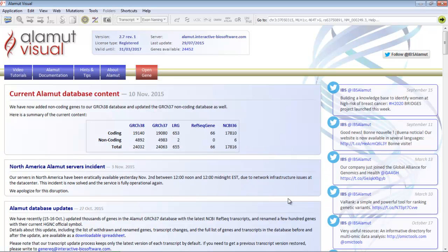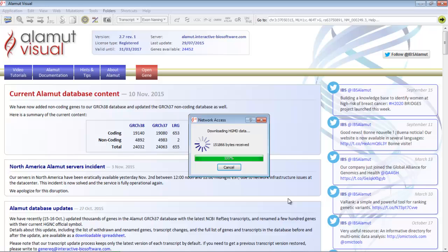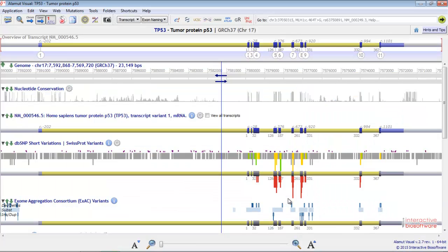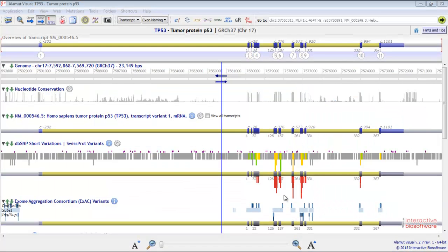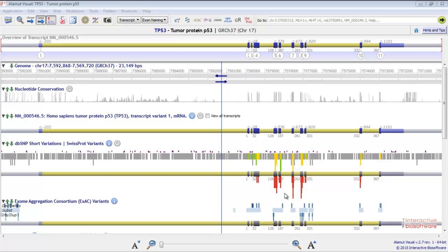The data are loaded from our server. You need to focus on the part you want to study. In order to do this, you have several possibilities.